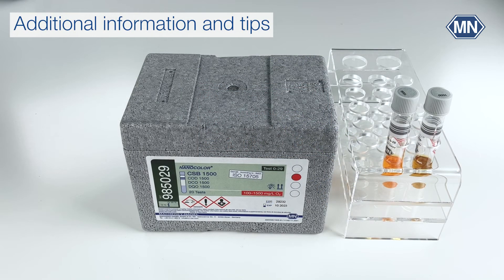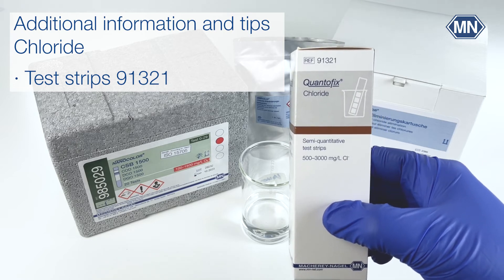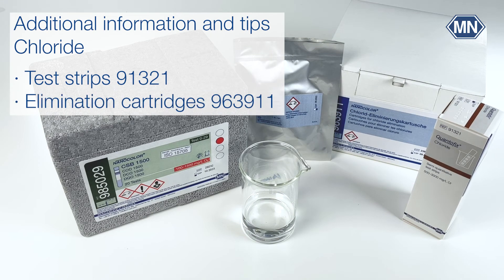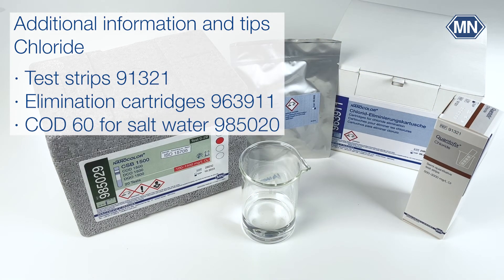A typical interference is chloride. Chloride ions interfere with COD measurements, and different kits tolerate different levels of chloride. Detailed information about chloride tolerance can be found in the instruction for use. Chloride levels above the tolerated level lead to heavy turbidity, which depending on the test kit leads to false high or false low results. In doubt of chloride concentrations, Quantofix chloride test strips can be used to quickly check the concentration. The chloride concentration can be lowered by dilution or by the use of Nanocolor chloride elimination cartridges. For high chloride samples, you can also use the Nanocolor COD 60 for salt water, which can tolerate up to 18 grams per liter chloride.